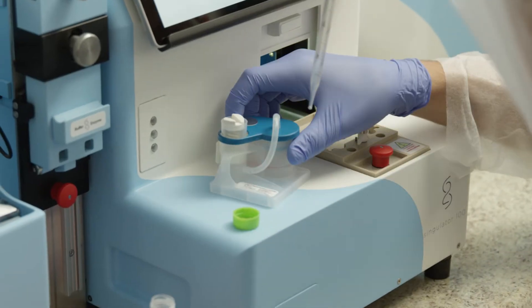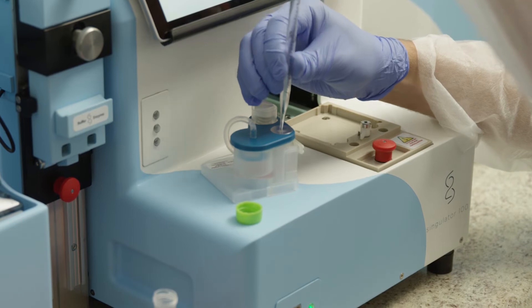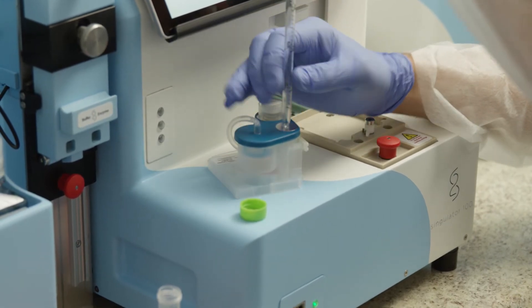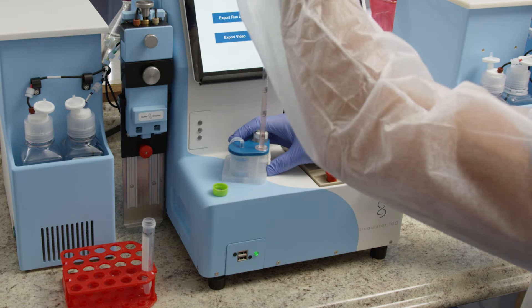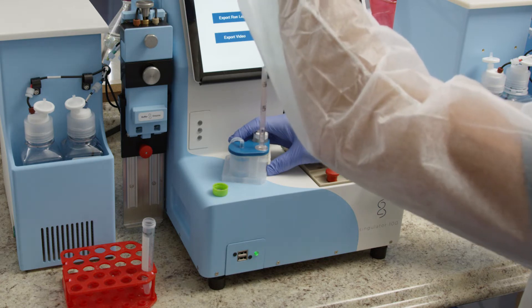Place the cartridge on a flat surface. Puncture the foil seal with a 1 milliliter or serological pipette and transfer the nuclei suspension to a 15 milliliter conical tube for centrifugation.